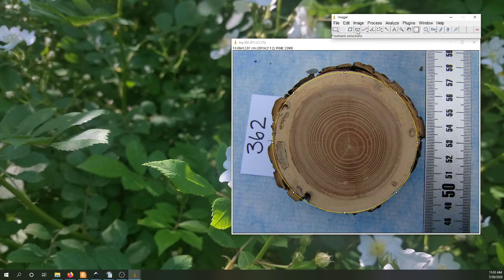If you wanted a little bit better measurement, you could actually go through and you could trace a line. And I'm doing this by just holding down and dragging my mouse. You could do a polygon selection where you're actually choosing each one of those handle points, and then you're tracing around like that. And so in this case, I'm clicking each time. So that gives me some freedom that I wouldn't have otherwise. All right, but we're going to start working with the line tool. All right, so that's what you saw the first time when I set the scale.